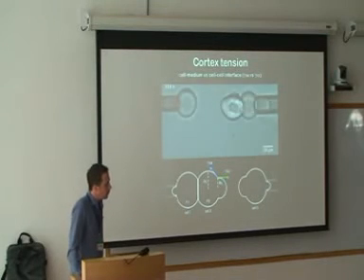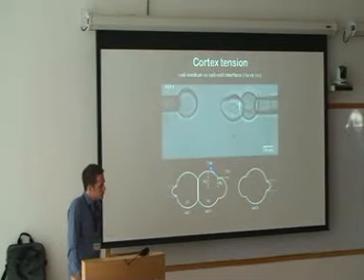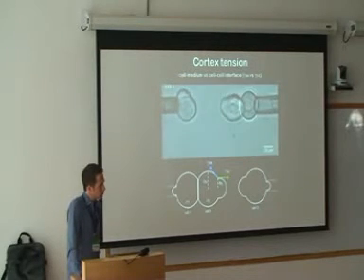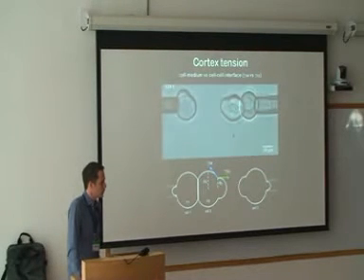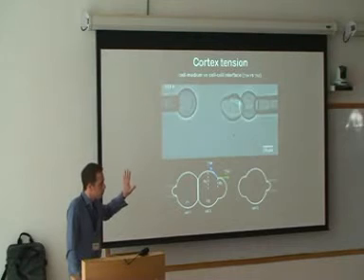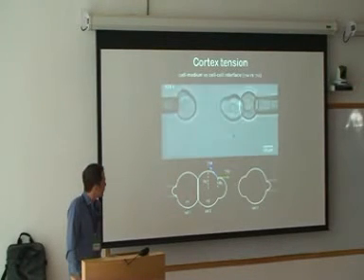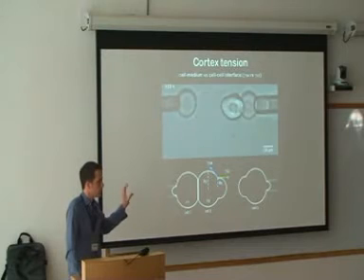Okay, but does the same work if you just don't take pipettes, but just sell it here on a flat thing, for example? You mean on a substrate? Mm-hmm. The problem is that if you put cells on a substrate, you have cell-substrate and cell-cell adhesion, which is complicating the thing. I mean, here you want to selectively look at cell-cell adhesion. And the way is that we want to unbind these cells, separate these cells, and the best way is really keeping them away from the substrate, just holding them with pipettes and putting them apart.